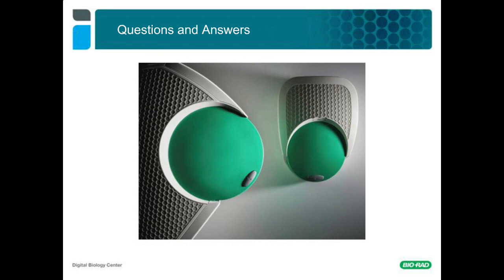I'm sorry, can you repeat that? So we have a user running SNP detection assays, and they have noticed the negative droplet intensities increase down the columns of the 96-well plate. Why does this occur, and do you have any suggestions to minimize this?